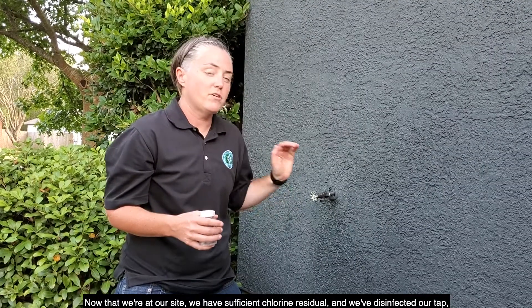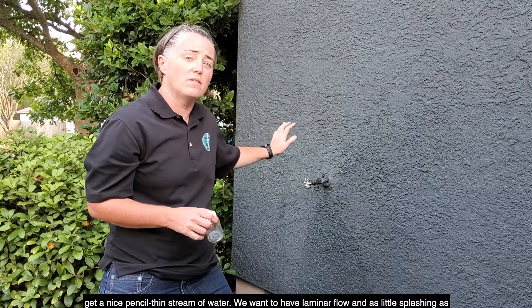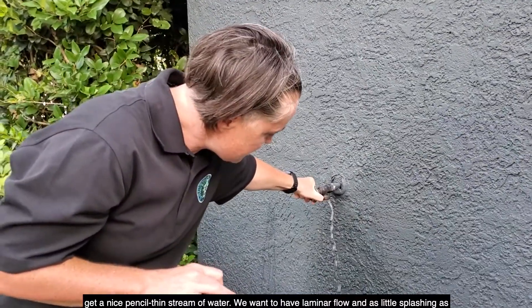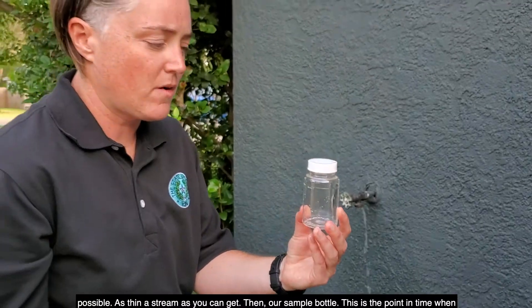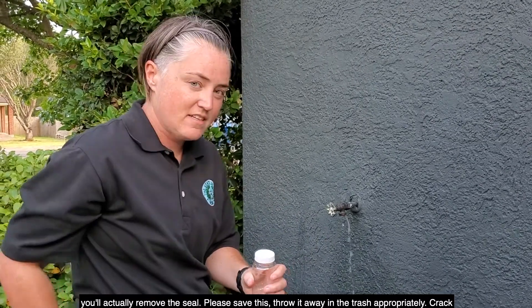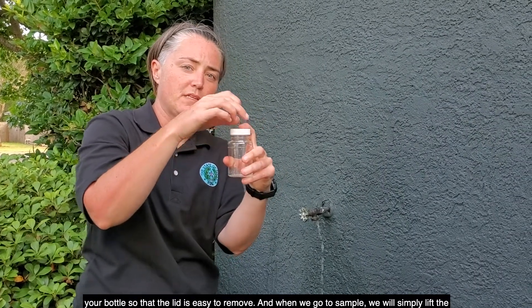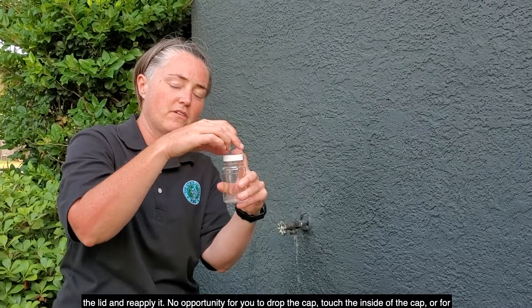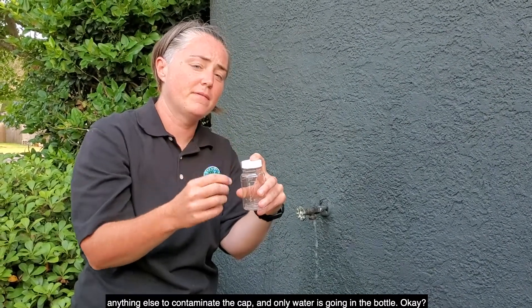Now that we're at our site, we have sufficient chlorine residual and we've disinfected our tap — it's time to actually sample. First, make sure you can get a nice pencil-thin stream of water. We want laminar flow and as little splashing as possible. Then with our sample bottle, this is the point when you'll actually remove the seal. Crack the bottle so the lid is easy to remove. When we go to sample, we will simply lift the lid, put the bottle underneath the water, and let it fill. Then when it's full, put the bottle back under the lid and reapply it. No opportunity to drop the cap, touch the inside of the cap, or for anything else to contaminate it — only water is going in the bottle.